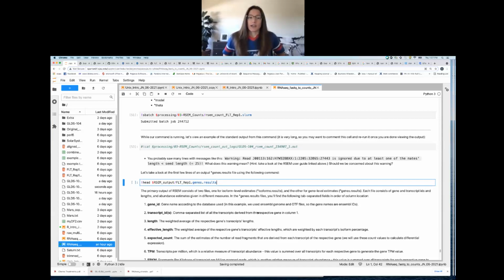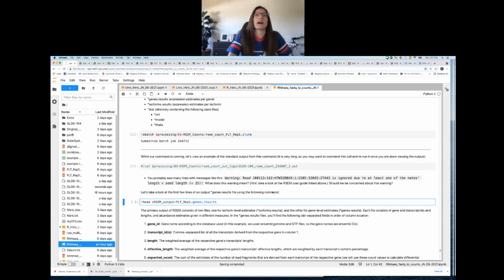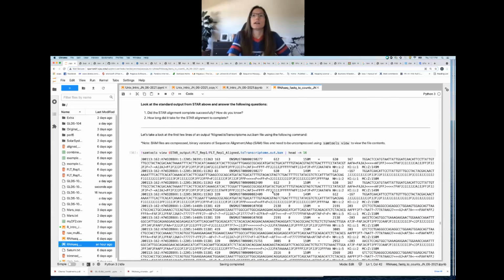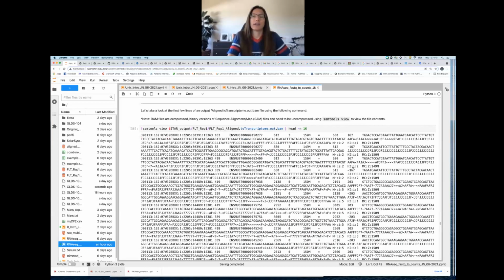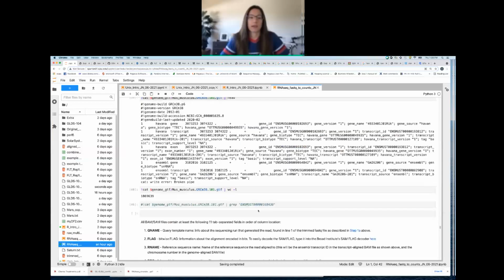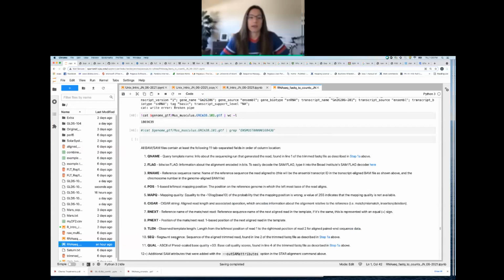So yeah, you can check that. So what you can do is, if you guys remember, we were kind of playing around with our alignment files here. And in those alignment files, we have an insert size, and we also have the exact read sequence that was mapped. And so that's our trimmed read sequence. So a couple of things we could play with, some Unix command, or for those of you who like Python, or pick your favorite language, since that sequence is always going to be in the same column of our BAM file. So that sequence is always going to be in column 10.